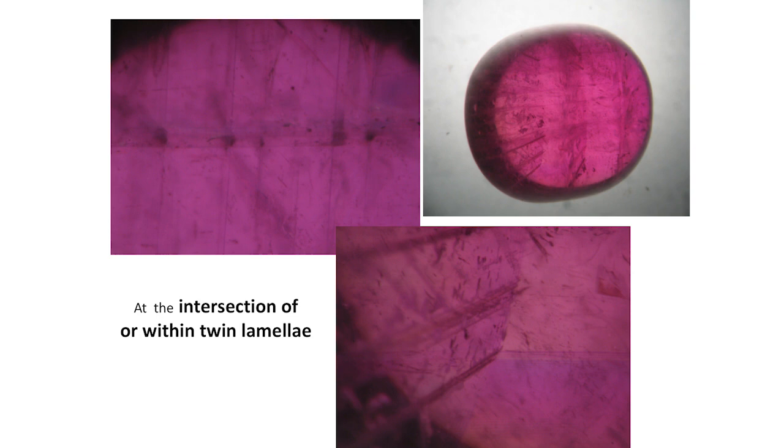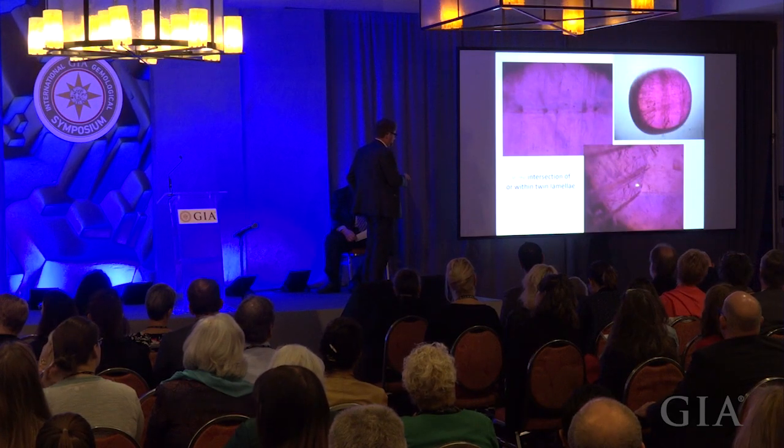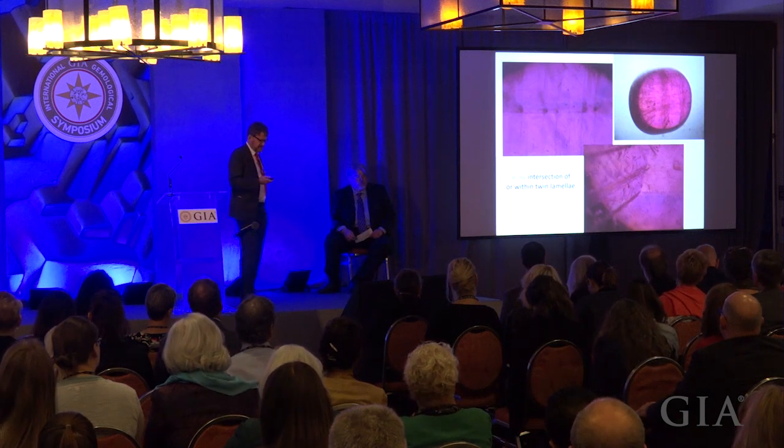Another characteristic that you can see even on not very nice stones like this one, which is literally filled with this kind of inclusion, is that this inclusion occurs at the intersection of twin lamellae. They are not twin planes, they actually have a certain thickness to them. So the corundum remains essentially a single stone. You can appreciate it's a twin here because you see in polarized light some differences in color and interference effect that you can identify.